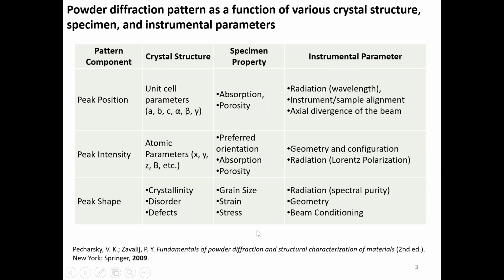Okay, so to get accustomed with powder X-ray measurements and the structural characteristics, please follow this book. I don't have the soft copy of this book, but if I can collect it, then I'll share it with you.